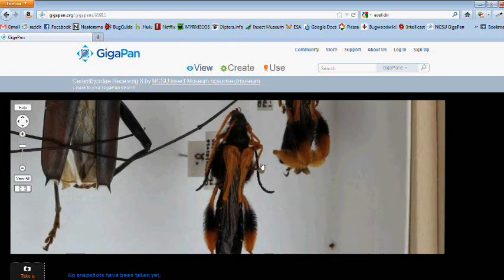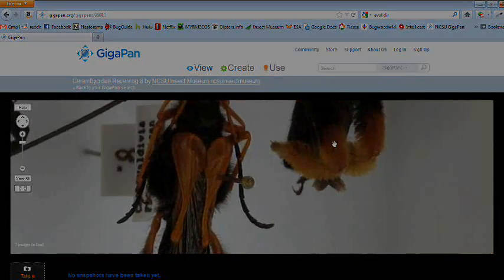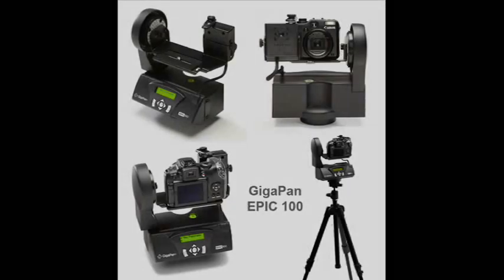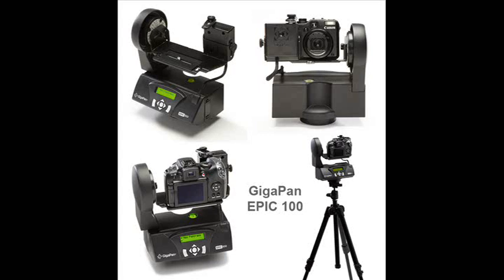But first, what is GigaPan? GigaPan is an imaging system designed to take multiple overlapping high-resolution photos of an area of interest and stitch them into one large panorama made up of millions to billions of pixels.